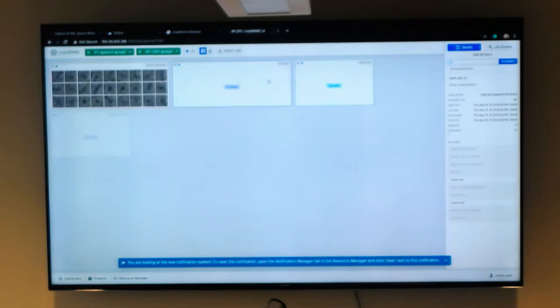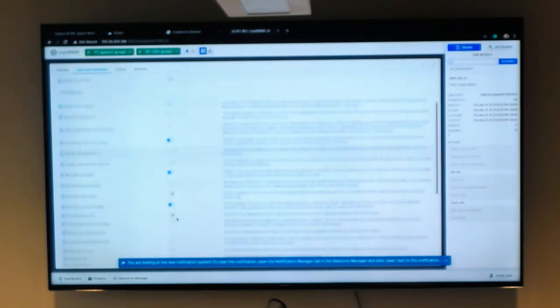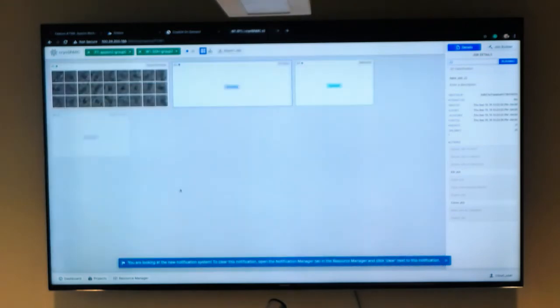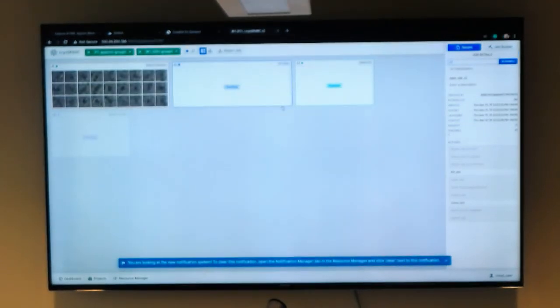Meaning if you just went on autopilot and accidentally created certain parameters, but you notice that you actually want to change certain things. Let's say GDH has symmetry and you just forgot to add symmetry, or maybe you don't want to add symmetry and just process at C1, then that's how you can do that. Something you'll notice is that as things are running, it will give you a lot of feedback in this log, and as jobs are running within this window, you'll see different outputs come out.